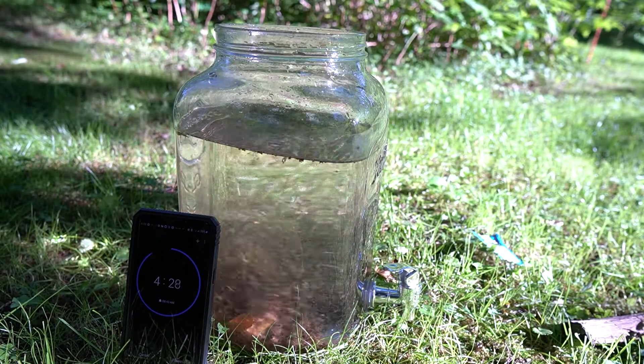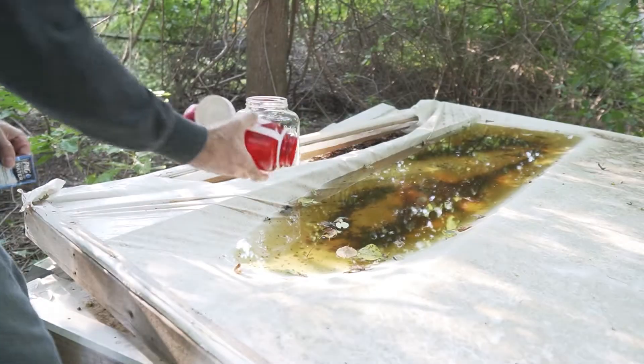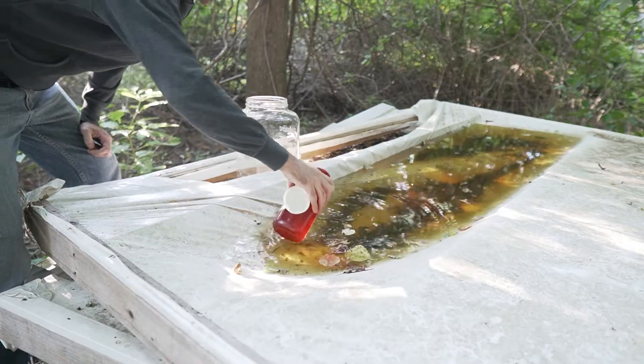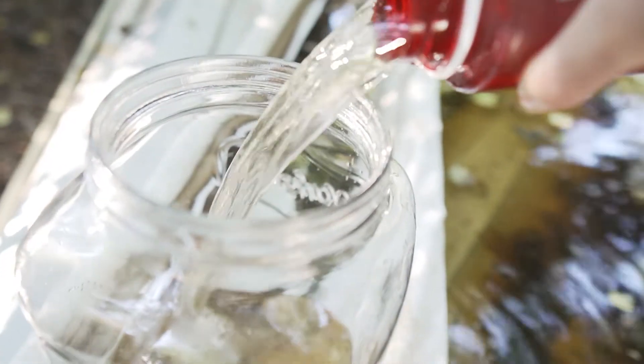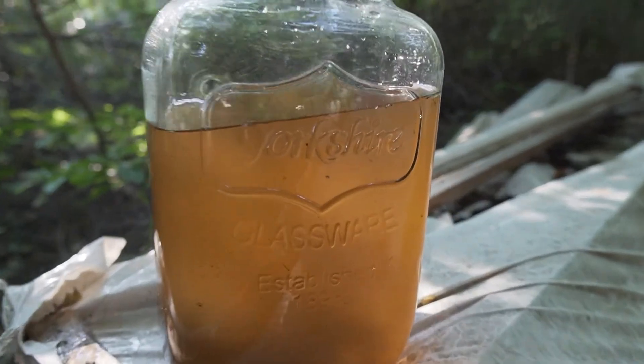We'll see how it separates all of the contaminants of the water. We'll look at it again under the microscope and then we're going to do a taste test. One of these packets will treat 10 liters of water, so I'm going to use a Nalgene bottle and just scoop up 10 bottles. There's all sorts of gross things swimming around in here. Here's the water we're going to be treating — you can see there's literally bugs floating around in there. I don't know if that's mosquito larvae or what, but there is a ton of nasty stuff in here and we're going to treat this and see what happens.